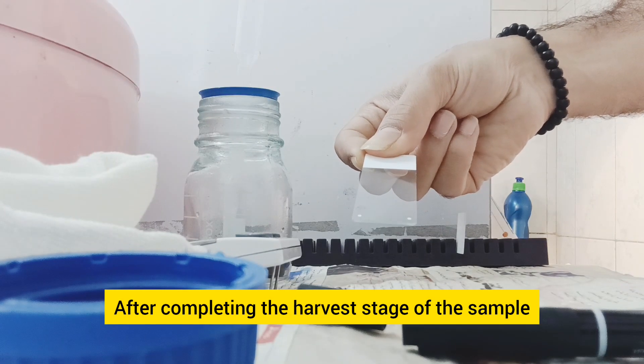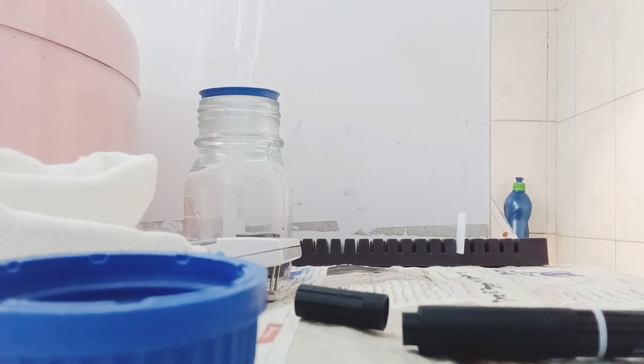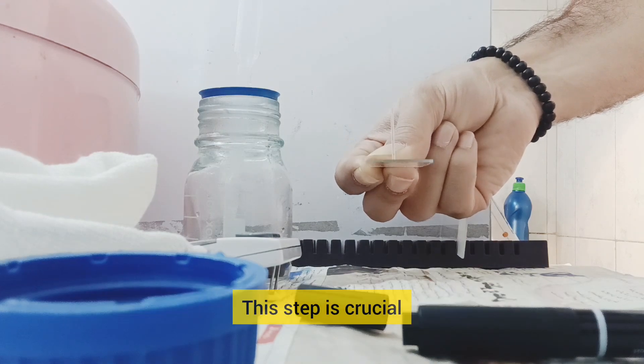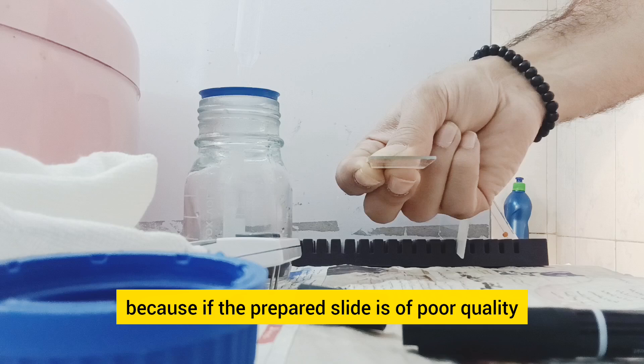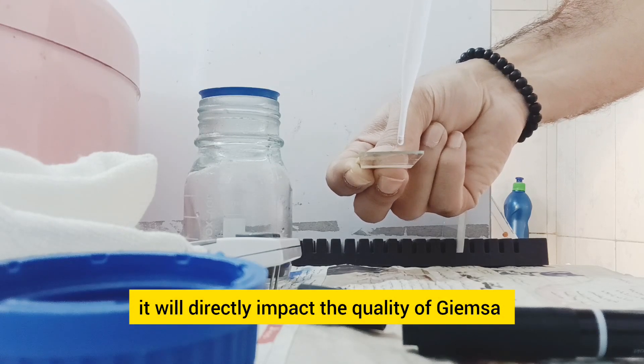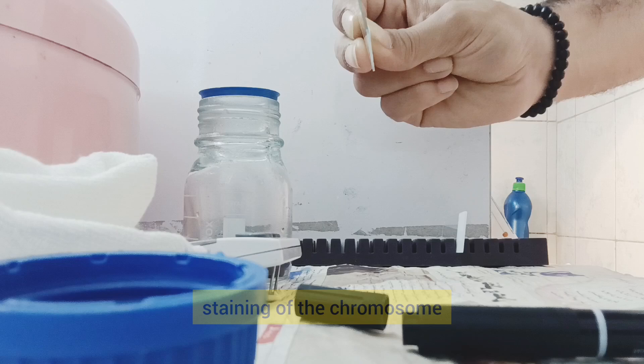After completing the harvest stage of the sample, you need to prepare a glass slide from the obtained pellet. This step is crucial because if the prepared slide is of poor quality, it will directly impact the quality of Giemsa staining of the chromosome.